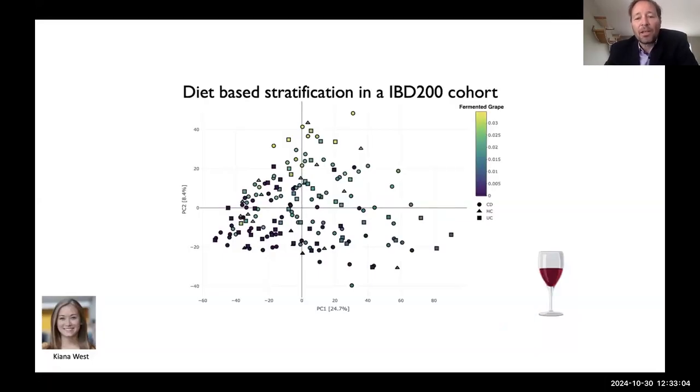But once you have this data organized in this fashion, you can do regression analysis and you can see if any of these proportional dietary patterns match to some of the clinical information that you have available to you.